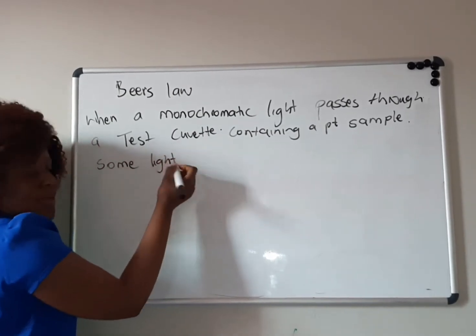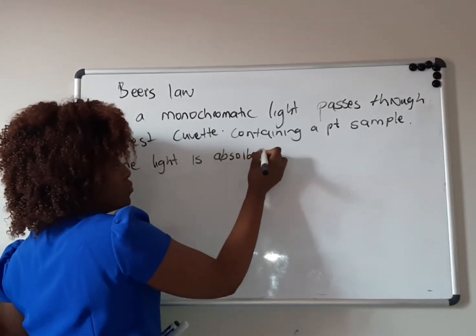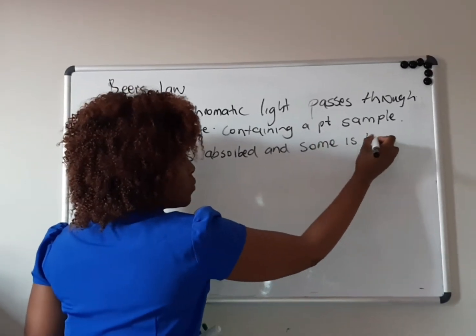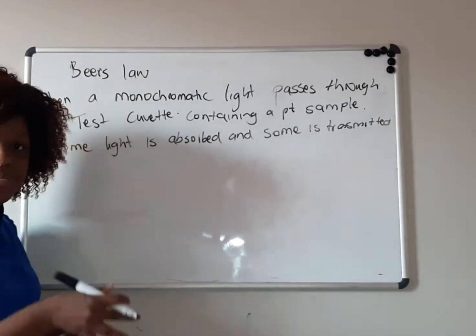Some light will be absorbed and some is transmitted.